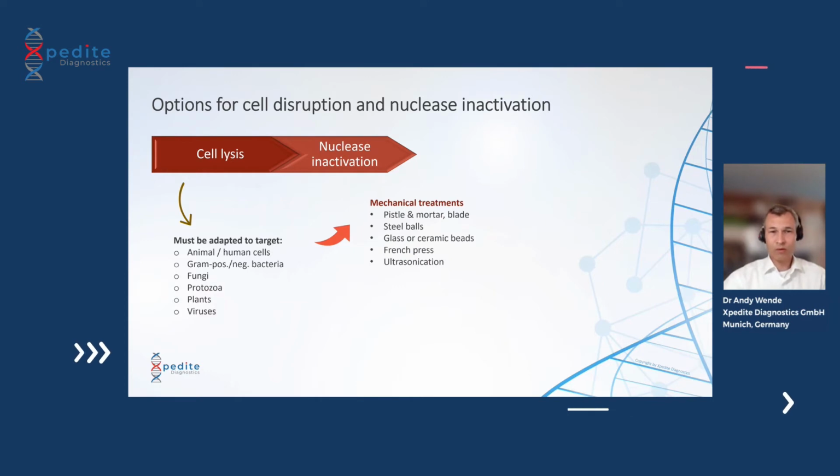And how is that done? You have basically in total 3 different possibilities. The first is mechanical treatment.